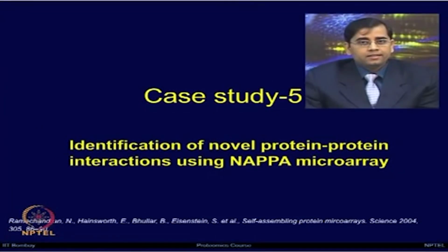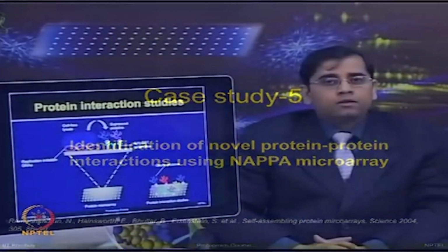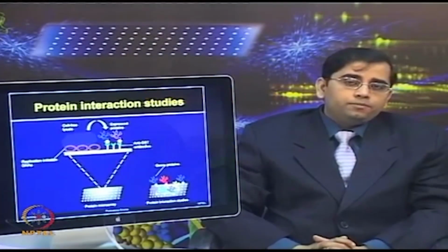So, let us look at some case studies which have used the protein microarrays for studying the protein interactions. Case study 5, identification of novel protein-protein interactions using nucleic acid programmable protein microarrays, a study by Ramachandran et al. 2004.